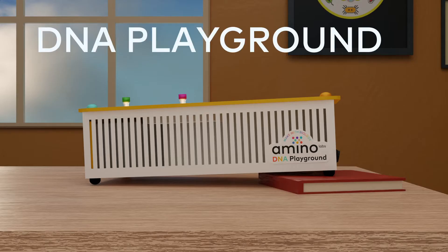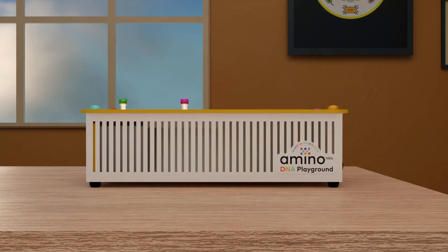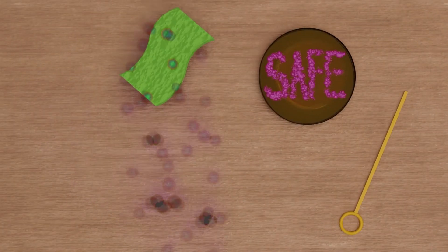If using the DNA Playground or Bio Explorer, place it on a stable work surface. Keep it level at all times. Clean up your station before and after use.